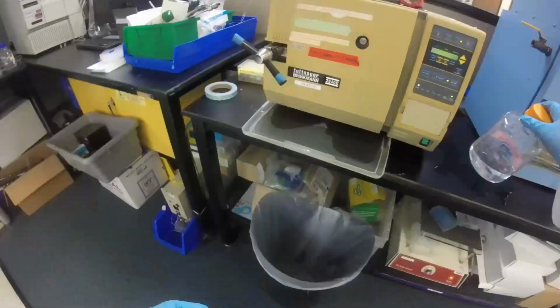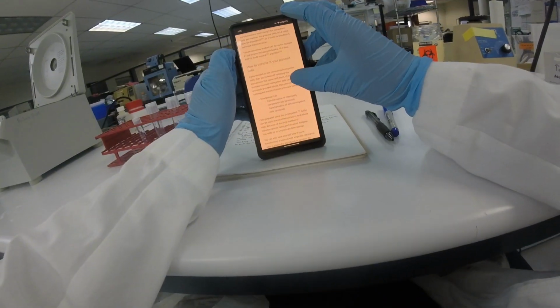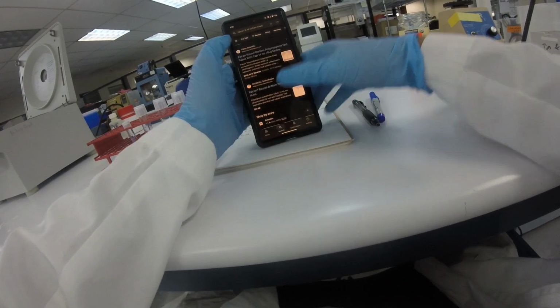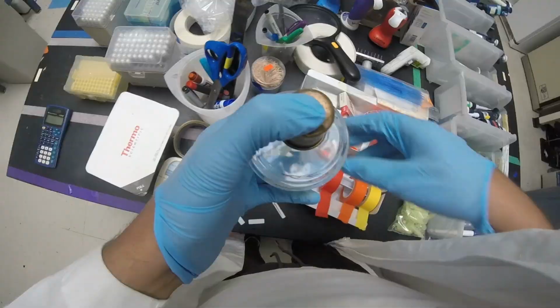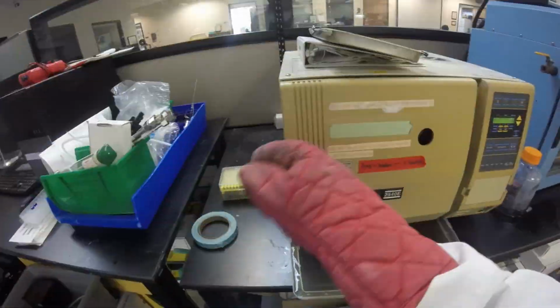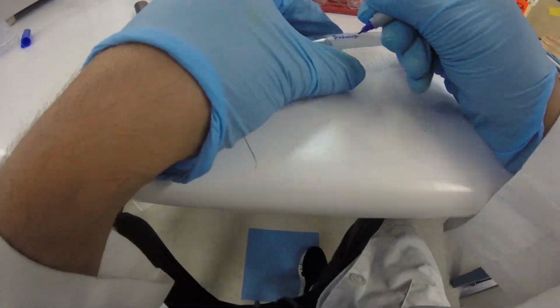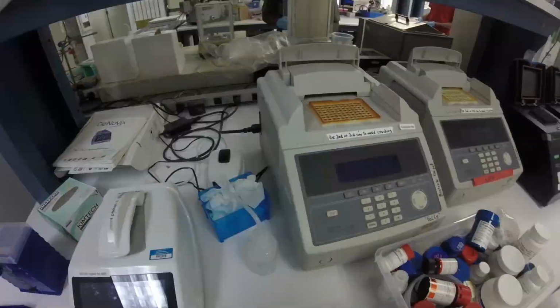And this is going to bring me to the thesis of this whole day, which is I really hate how tedious and manual this whole thing was. I mean, first off, I was surprised that it even took 4 or 5 hours to start getting into the log phase, even at 37C. That was pretty surprising to me. I think it would be interesting to model that in more detail, including all the metabolism that's going on and everything.